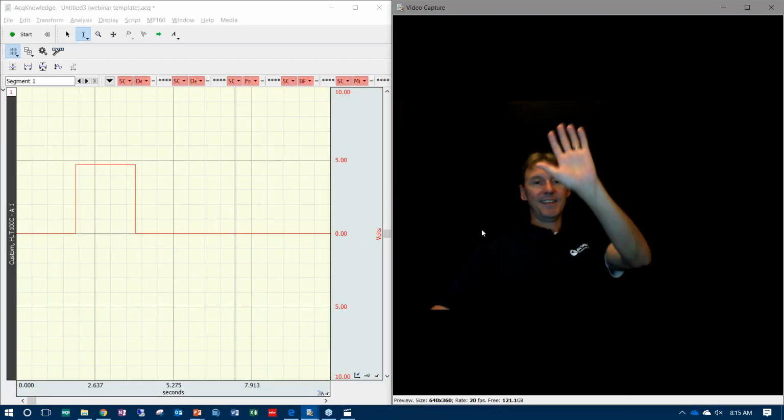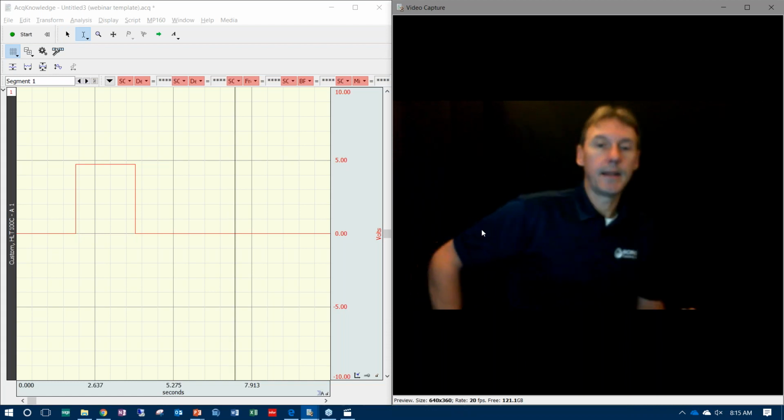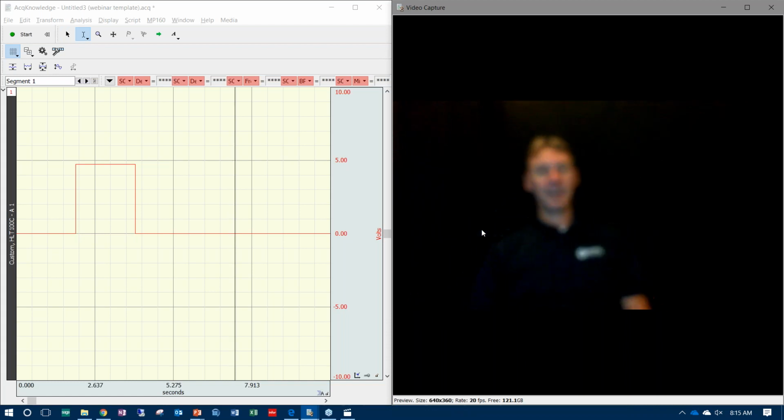And good morning, everyone. I've got the camera on. I'm sitting in the control room, and as I move around, the camera's going to try and refocus on me so that it's got a good image. The camera is just sitting on the shelf right in front of me. And what I'm going to do is show you how to set this up so that we can synchronize the video to the physiological data.